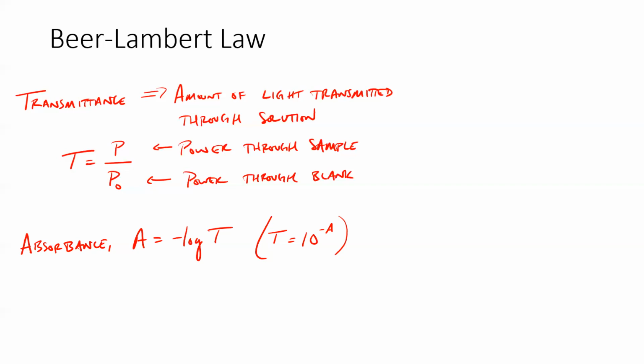Those are useful going back and forth. If we want to figure out our limit of linearity, and we know that we can go up to a certain concentration on a particular instrument, and we change instruments and know that our power is going to go up by 50%, we can back calculate how wide that linear range could be given that new power, by figuring out what the new absorbance would be and going from the new absorbance maximum to the new concentration maximum.